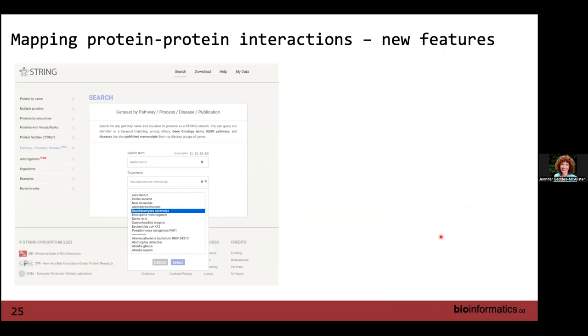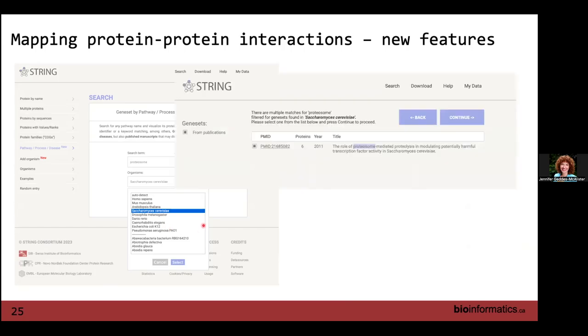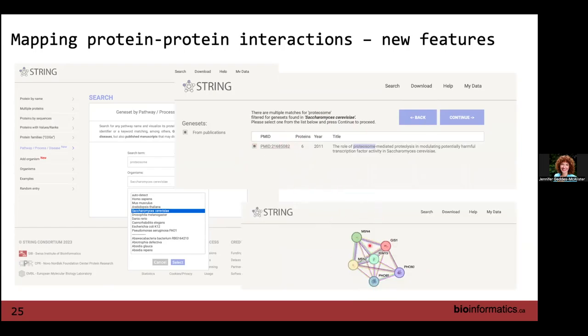New features I wanted to highlight are the pathway and processes section where you can enter a term of interest. I've selected proteasome and chosen Saccharomyces — it gives you a term, and clicking on it links to a paper specifically on the proteasome within Saccharomyces. Here's an example looking at a very defined cluster within the proteasome of yeast, with all kinds of different edges representing different evidence. This is a nice feature if you want to look more generally and didn't have a list of proteins but knew a function of interest.